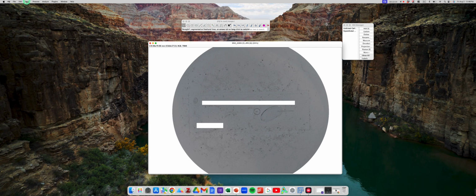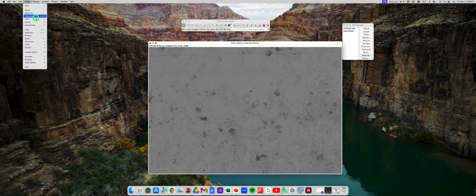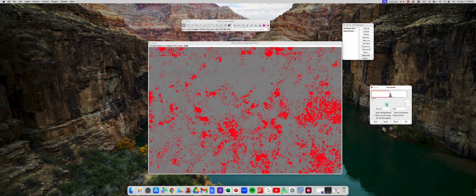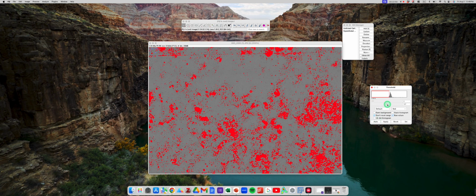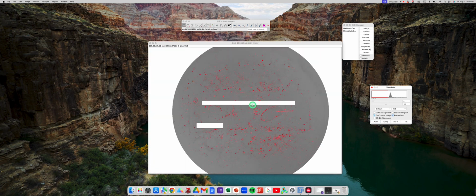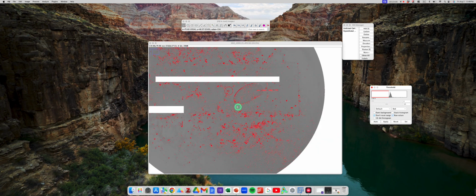And then now we'll do the thresholding. So convert it to an 8-bit like that. Zoom in. Click image, adjust, threshold. You can click auto, but I think that is probably a bit too much. Zoom out. It should look approximately like the powder that we saw when we were under the microscope, so I think that's pretty good. Click apply.